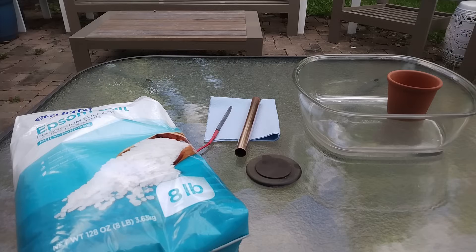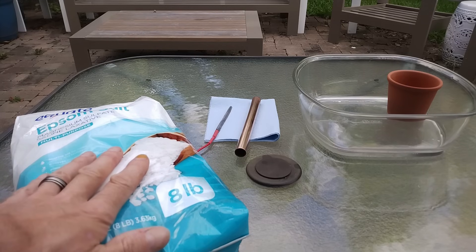Hi everyone. In today's tutorial I'm going to show you how to turn Epsom salt into 98% concentrated sulfuric acid. For this tutorial you will need some Epsom salt. Make sure that it is pure and unscented.